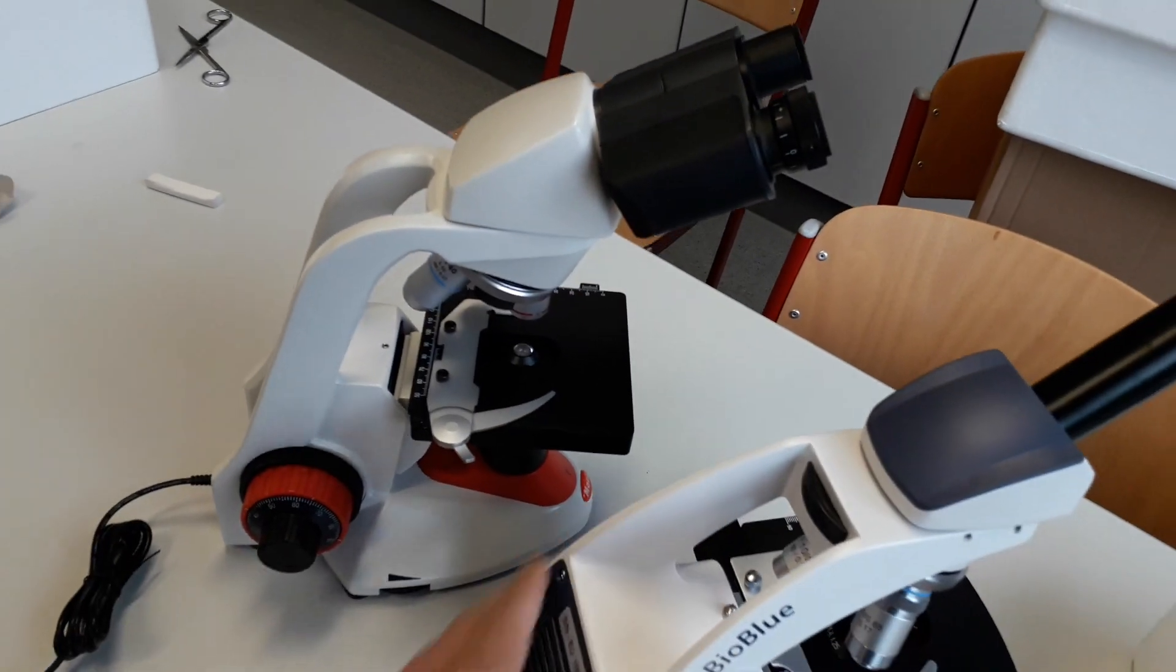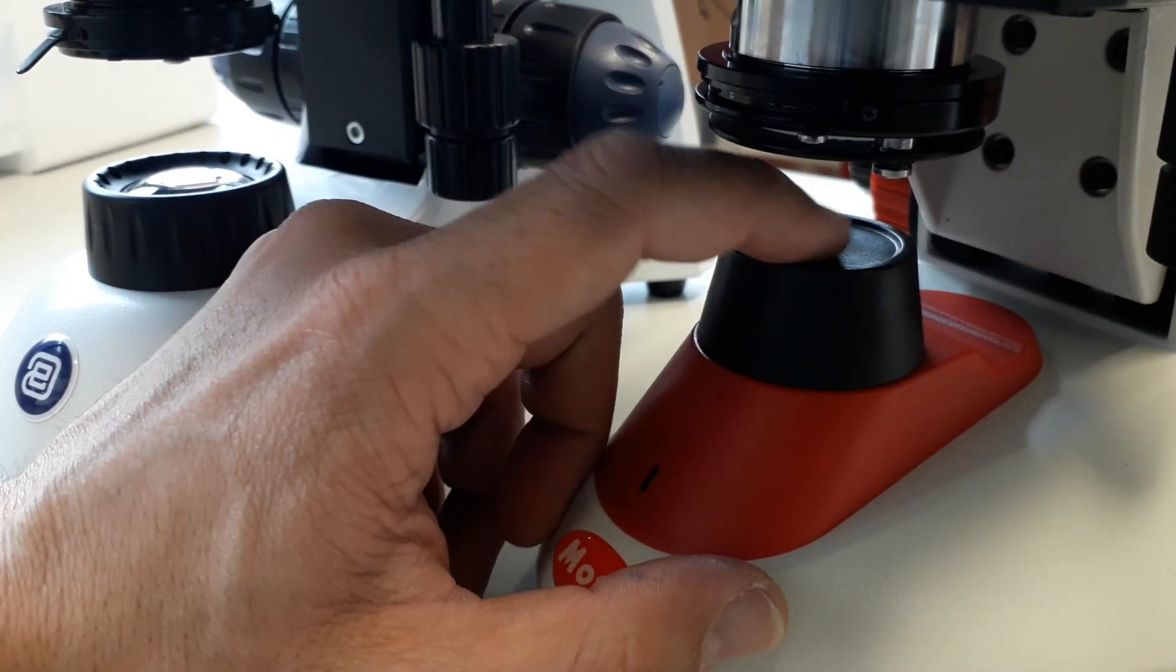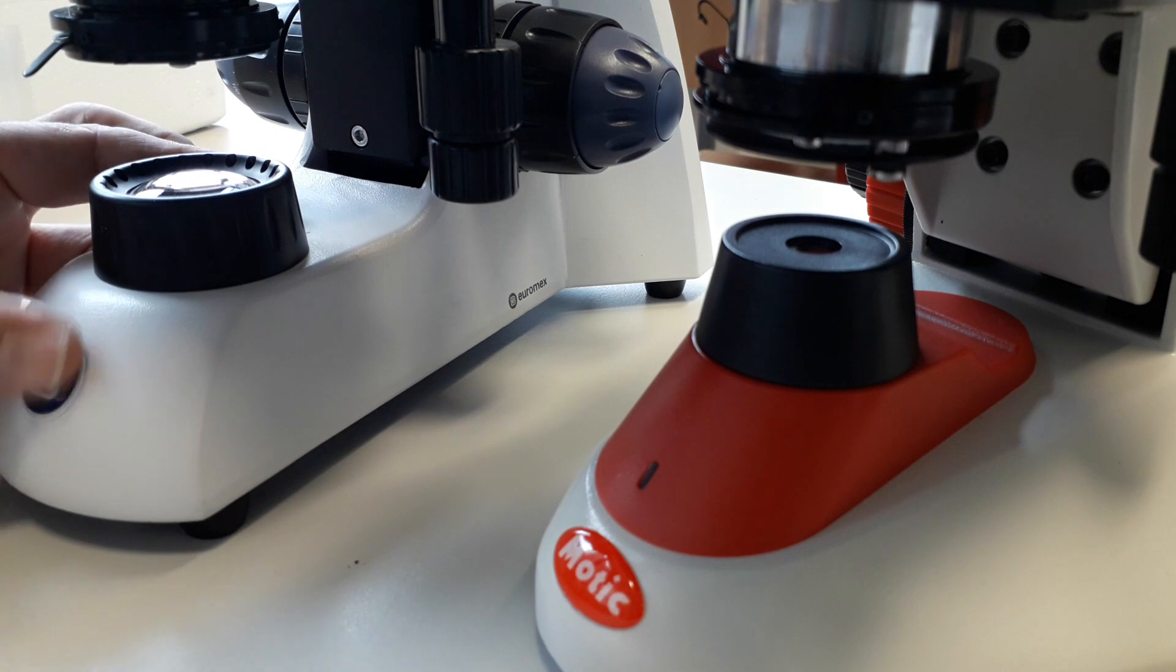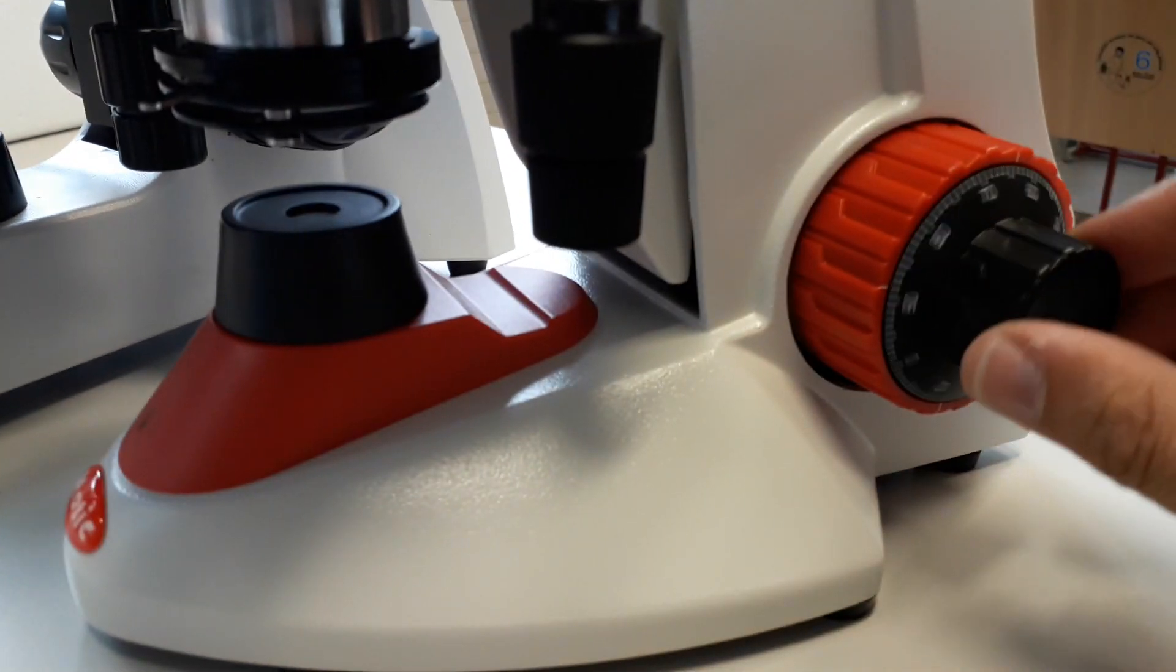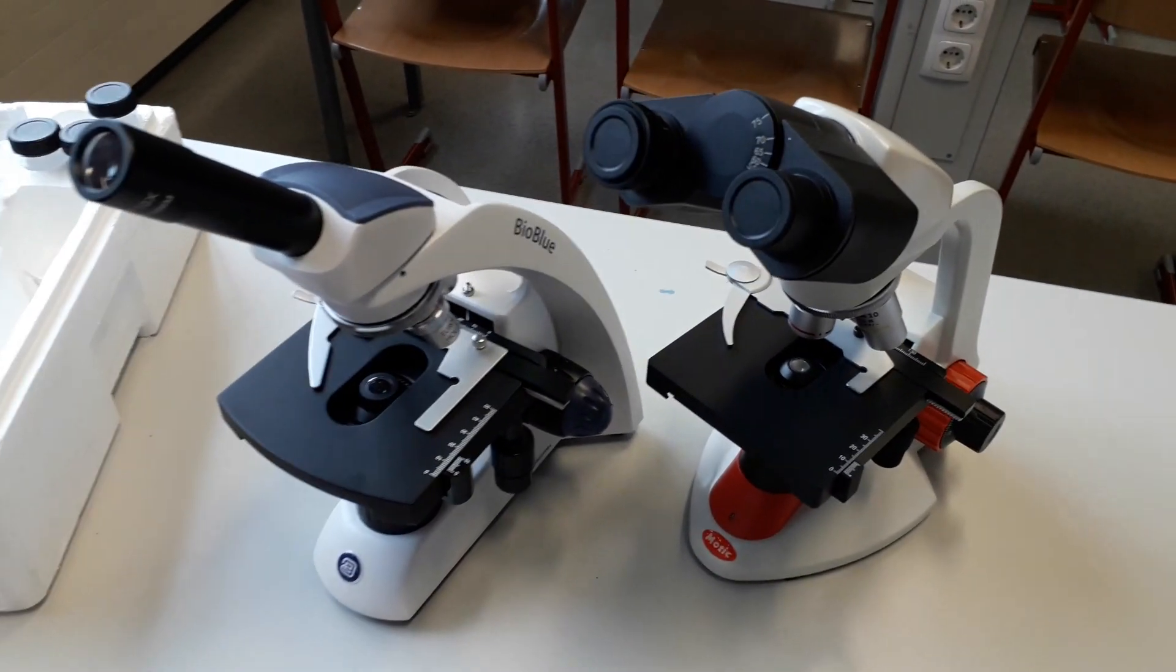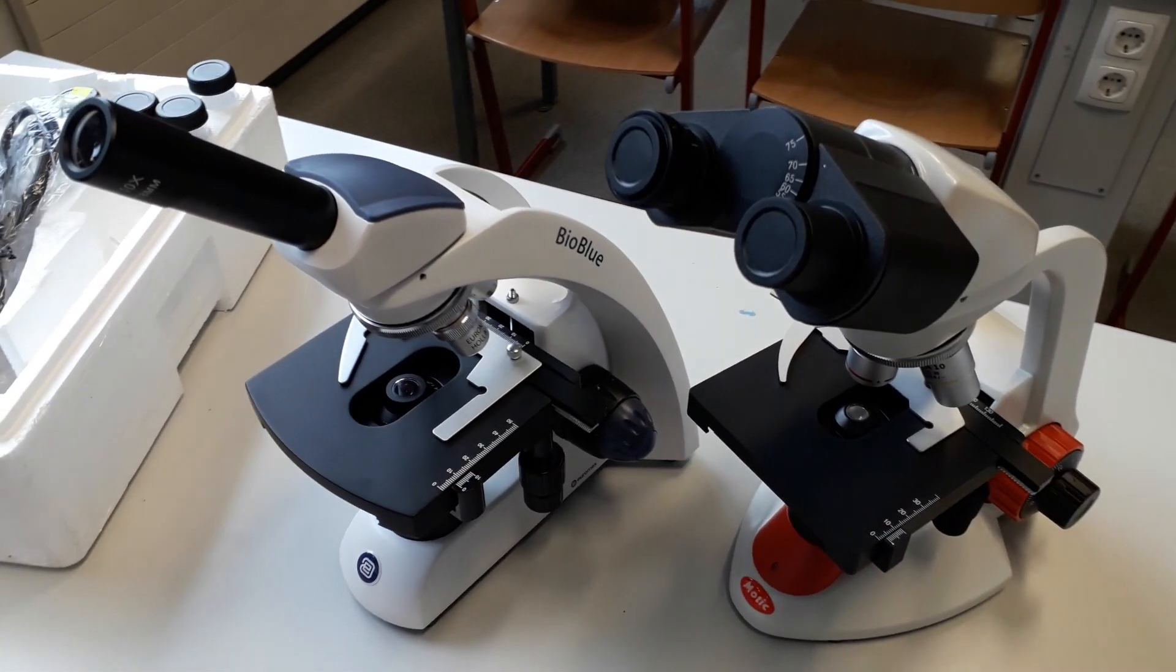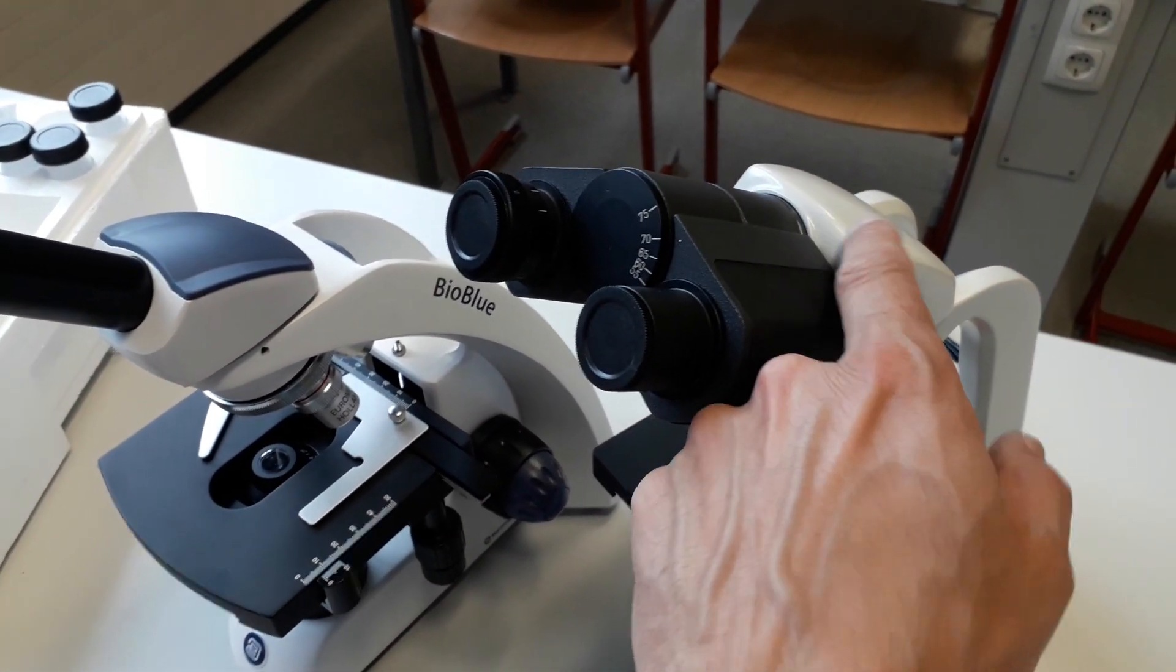And here, of course, we have an internal power. Just to realize that you can also attach a fourth objective here. So both of them have basically four objectives. I would say that basically both of these microscopes are pretty much equal. They're pretty much the same. Well, this one over here, the lamp here is a little bit smaller. Maybe it already is concentrated a little bit more than over here. Here there's a larger lens, but I don't know if this actually makes a significant difference concerning light intensity.